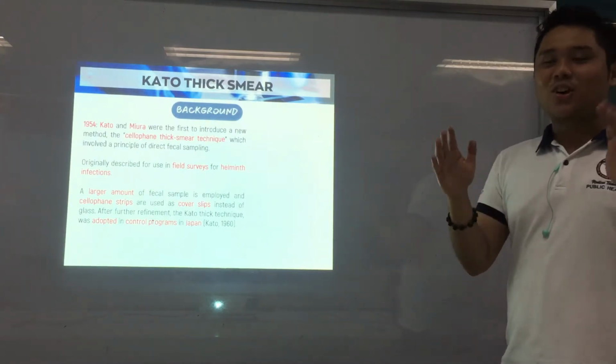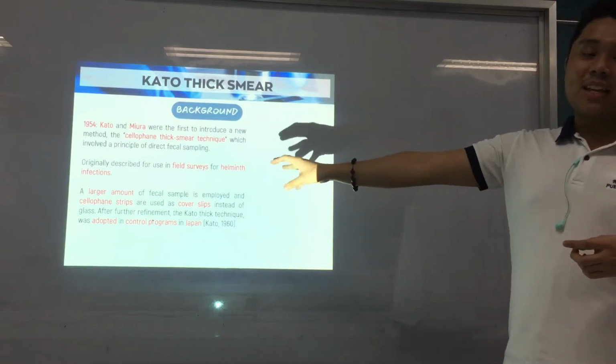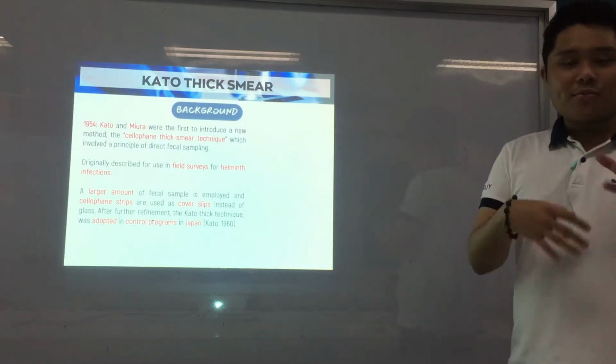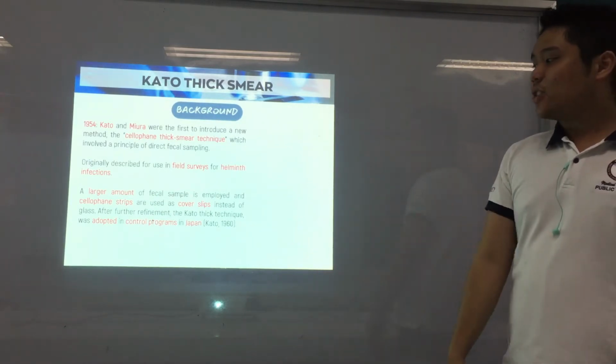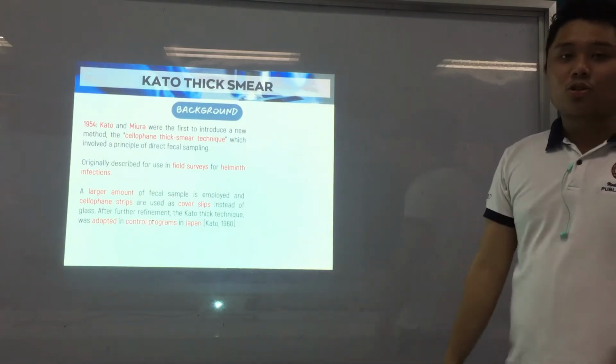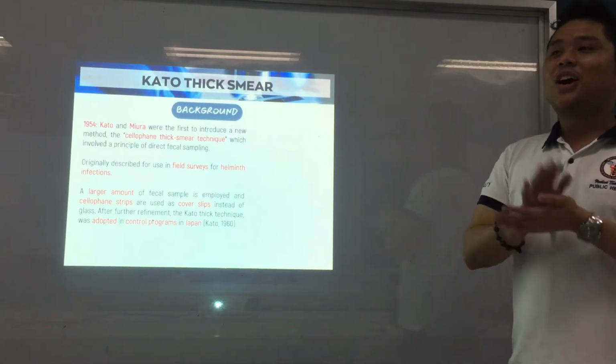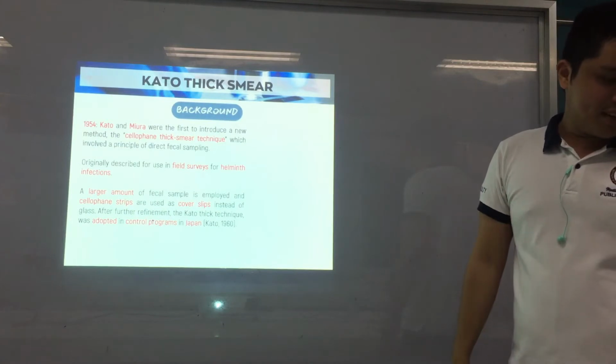I hope you get the picture. That serves as our cover slip, so we don't use glass cover slips. After further modifications, the Kato thick technique was adopted in control programs in Japan in 1960. So that's a brief history.